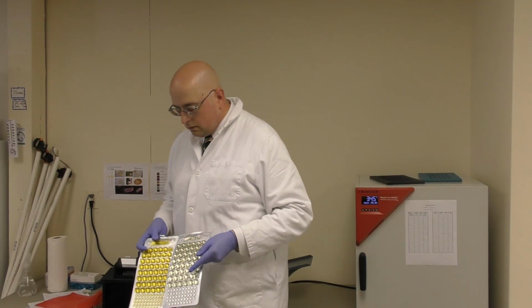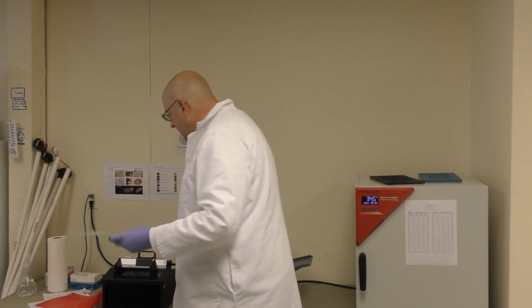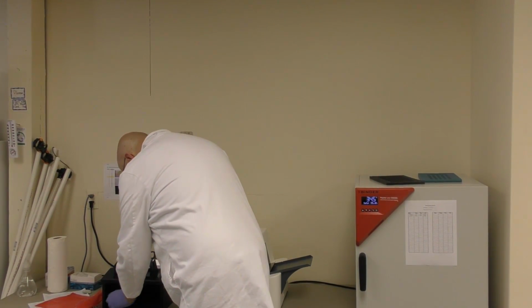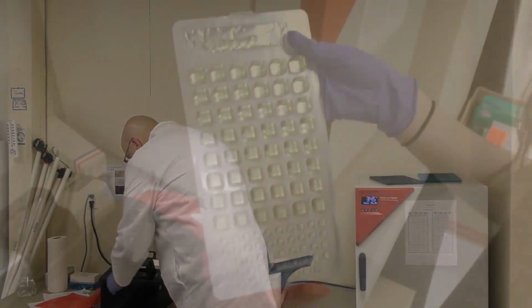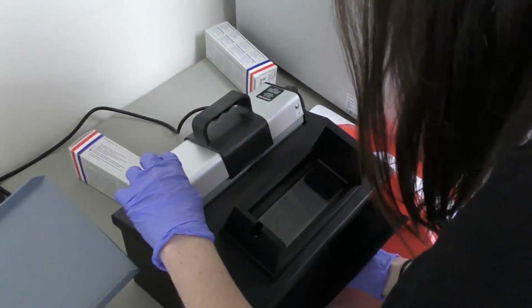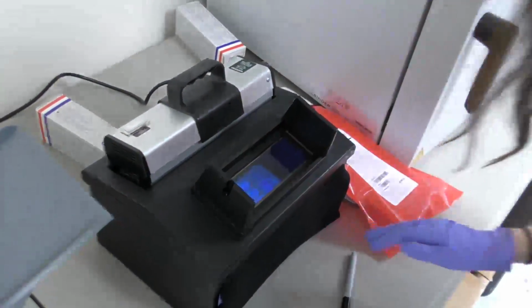And you'll notice here, very different color, right? But if you put this underneath UV, you can still see that strong fluorescent color. It's not as bright as the current sample, but that's okay. So the tray that they provide you kind of gives you a nice baseline of this is the minimum glow that you want to look at. If it's any brighter than that, it's definitely E. coli. If it's any less, maybe not so much.